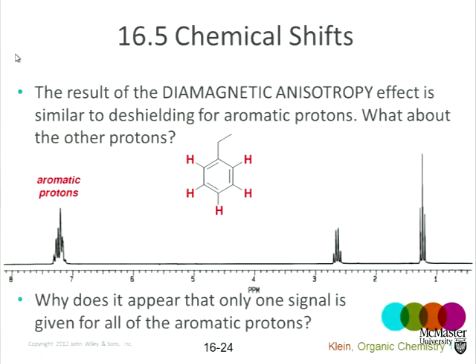So here is ethylbenzene, the compound that we started with. There's the structure, okay? And you see that these aromatic protons are shifted remarkably down to about 7 ppm. They're in the range where we expect hydrogens attached to sp2 hybridized carbons. Remember, hydrogen attached to sp2, as in those benzene ring hydrogens, more than 5 ppm. Hydrogens attached to sp3, less than 5 ppm.